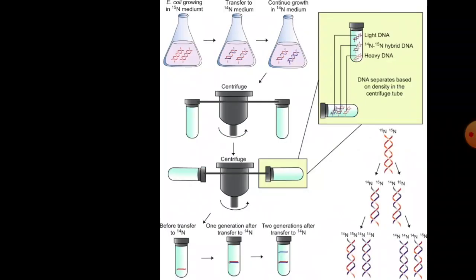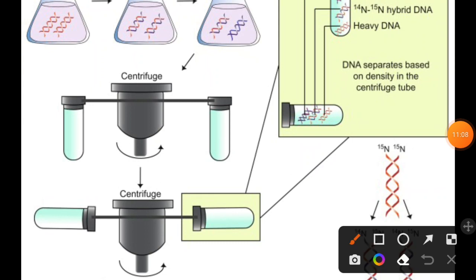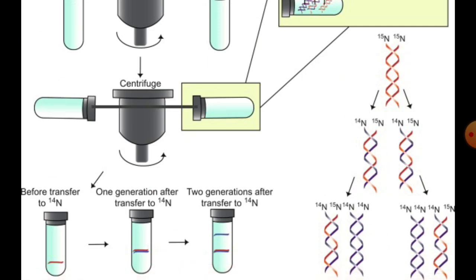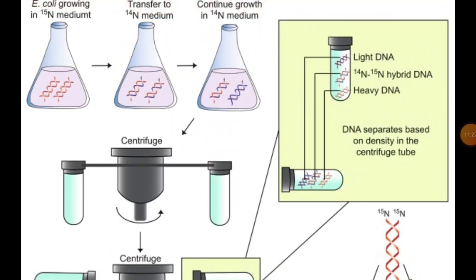Here in one tube we keep our sample, another is balanced, and it is spun to generate centrifugal force, and as a result we separate them in a gradient. I hope you get that.